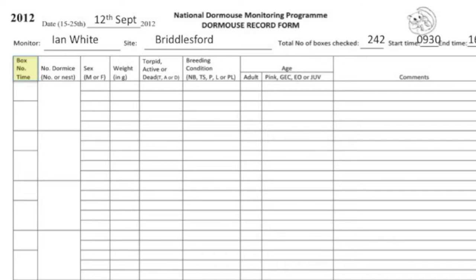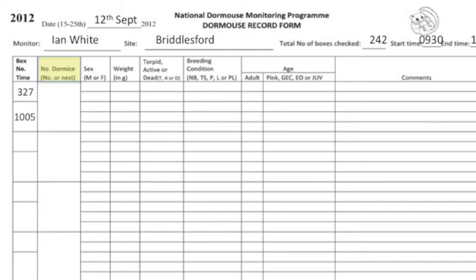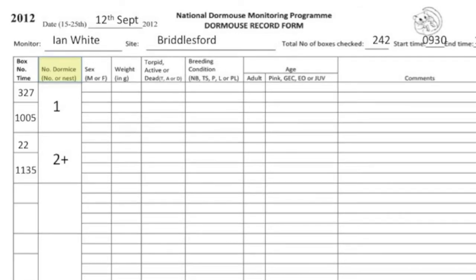In box number and time, record where you found the dormouse and when. In number of dormice or nest, record the number of dormice found in a box or whether a dormouse nest was present. If the animals are young and you don't wish to disturb them, record the minimum number known to be present.